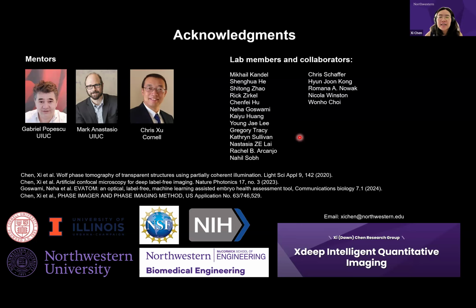In the methods section, we have a very detailed description of all the details of the training session. Is there prior physical knowledge in the training? No. Other than those pairs of images, the network does not have any prior physical knowledge.